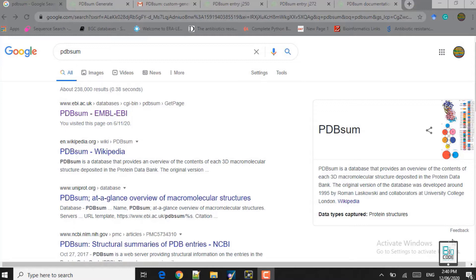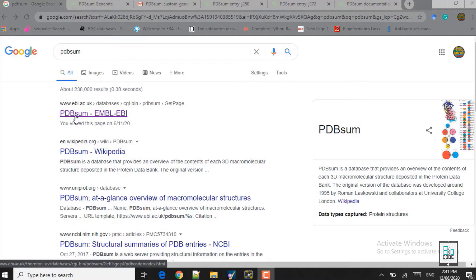If you haven't watched that lecture, you can refer to the PDBvisa evaluation of docking complexes on the Bio Code platform. Moreover, if you want to know about protein-protein docking and protein-ligand docking using the Molecular Operating Environment software, the lectures are also available on the Bio Code platform. So let's get started with PDBsum.